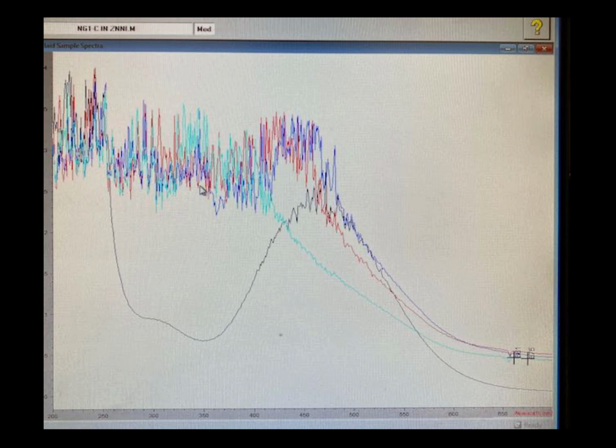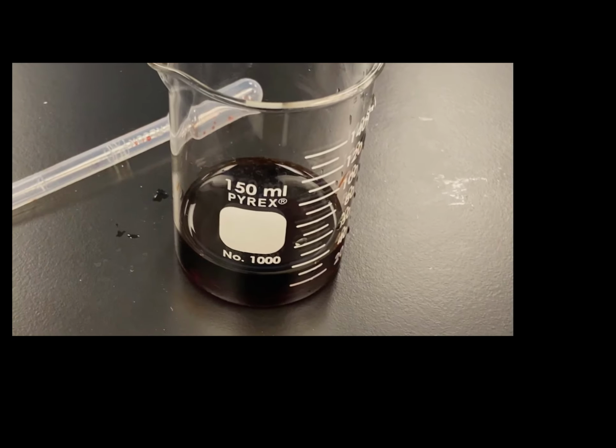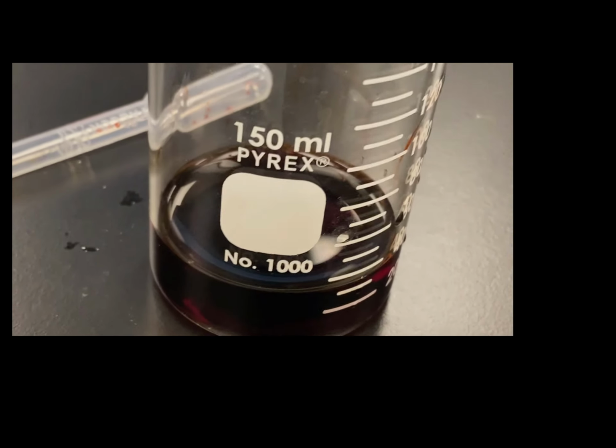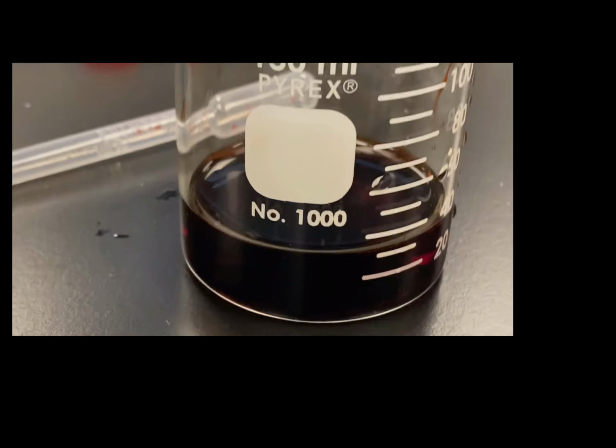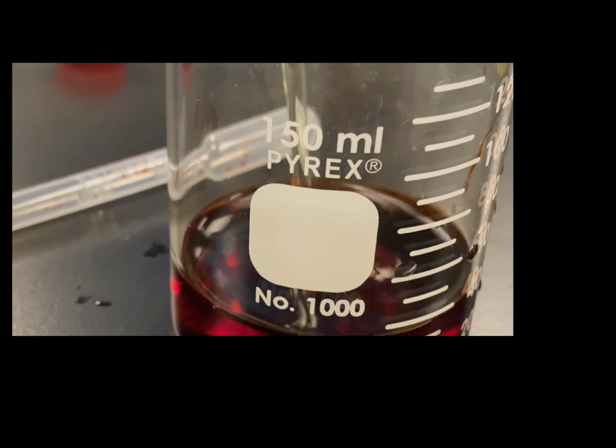I'm going to show you what happens when you add to the GTC. Now here's the GTC itself with iron and the acid. So all you're seeing here is this red color that I normally test for. Now here I am adding some of the Roche SPU sample because I have the most of it. So I'm adding that here. And watch what happens to the red color. It just goes away, like, entirely.